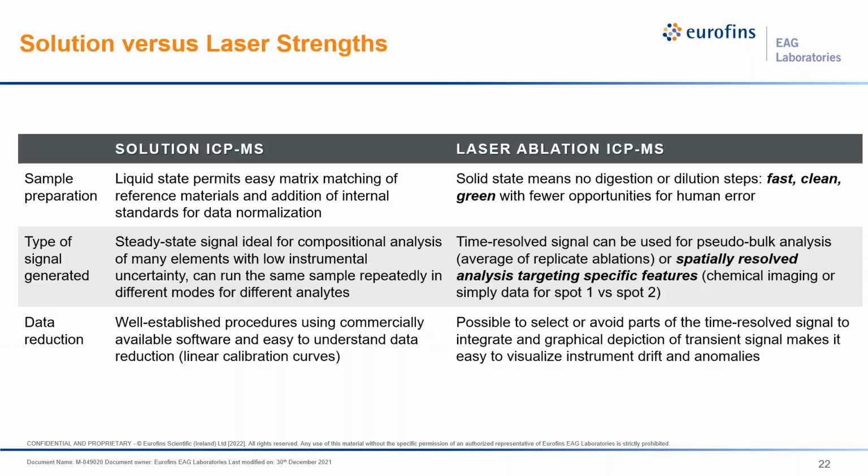So my apologies, this one's fairly text heavy, but let's just work through this. It's just a couple of examples here that I think are pretty good at illustrating the strengths of laser ablation versus solution ICP-MS. They both have things they're very good at, and they're not necessarily the same thing. So let's just start with sample prep. So some of this we talked about before.